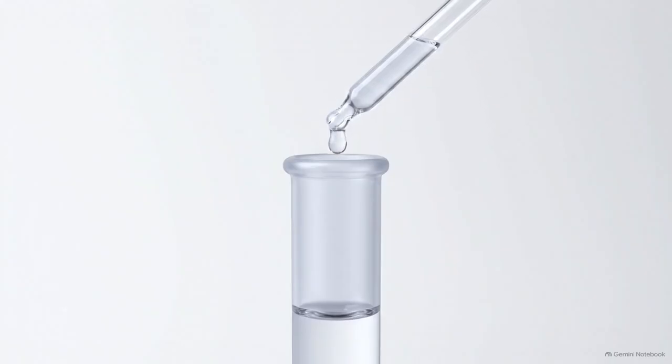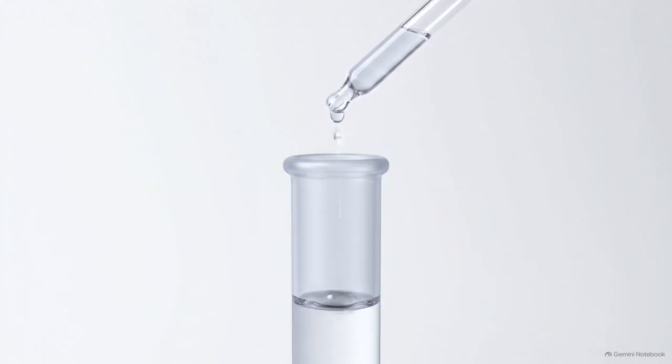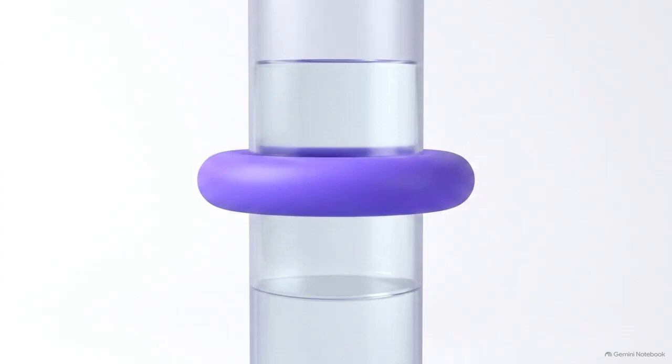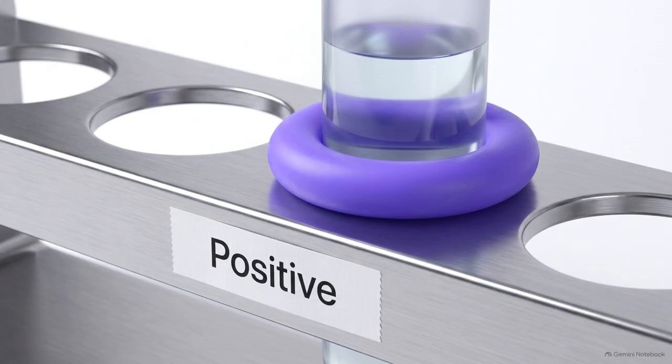We start with Molisch's test, dropping in a solution of alpha-naphthol, followed by a dose of concentrated sulfuric acid. The acid acts as a dehydrating agent. Almost immediately, a distinct, vivid purple ring forms at the junction of the liquids. That ring proves our sample is a carbohydrate.